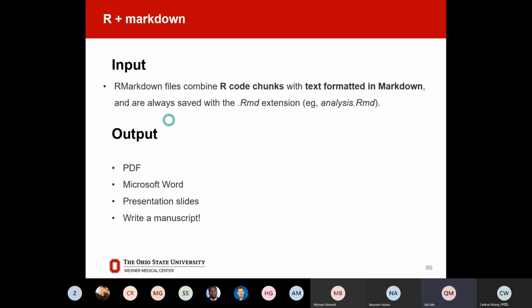So that's the best part. Yeah, actually, our lab is using R Markdown very intensively recently, both for our own report progress and for collaboration with others. So people like this way. All in one, and it's very easy to reproduce something.